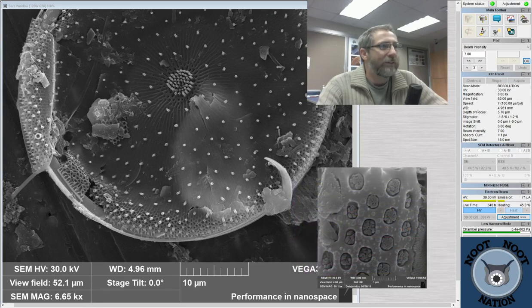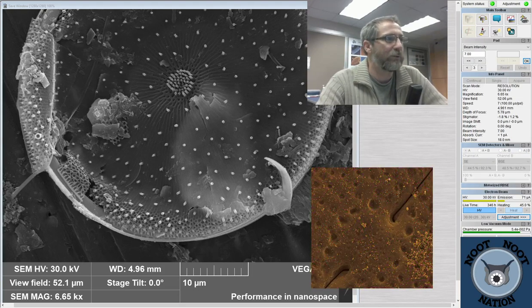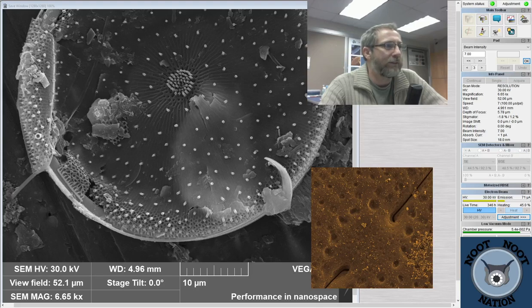What are all the rocks scattered around the edges? Yeah, that's bits and pieces of other marine organisms that have died, or organic matter that didn't get destroyed, or pieces of diatoms or sediment particles. Mostly clay, and some of it might be as big as sand size.